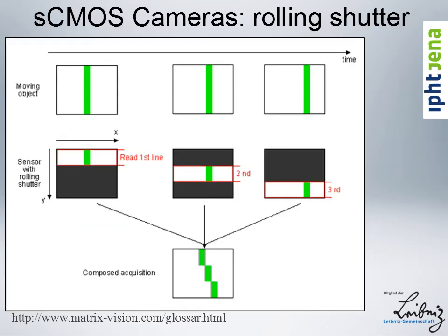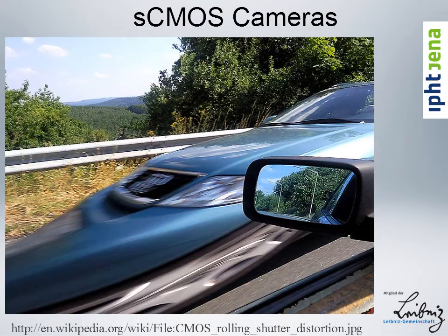This is again the effect of the rolling shutter. I can show you how this looks when you take an image, for example, of a car passing by. It looks like this. While the read line was still there, nothing much happened. But here the relative speed and angular speed was very fast when the car passes by, and you see how distorted this wheel has suddenly become.